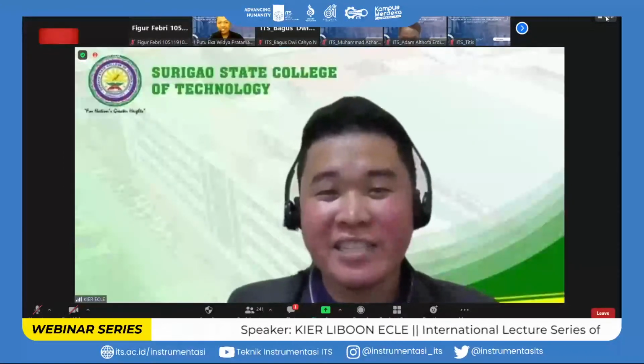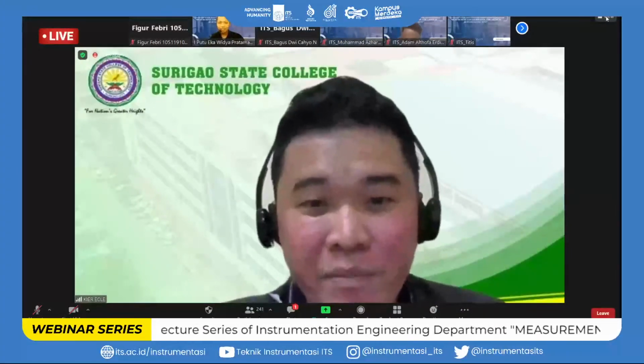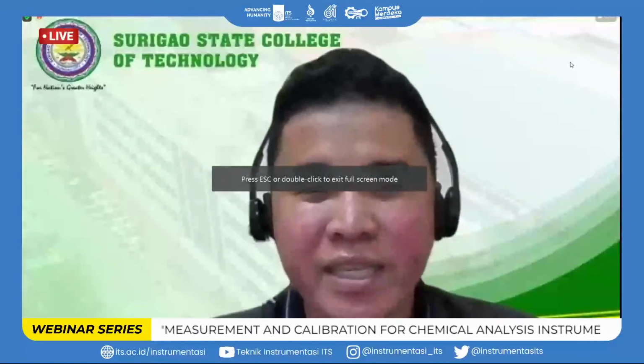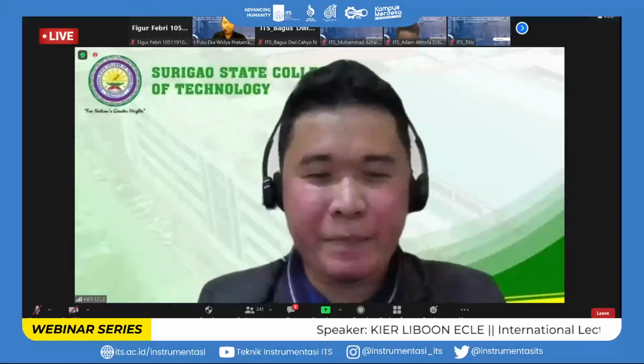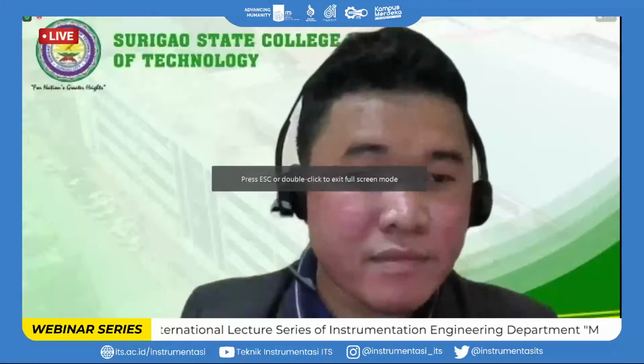So the uncertainty 95% certification calibration: how to read uncertainty 95% certificate calibration of spectro UV-Vis. I presented earlier the standard operating procedure, the acceptance criteria and the corresponding uncertainties.